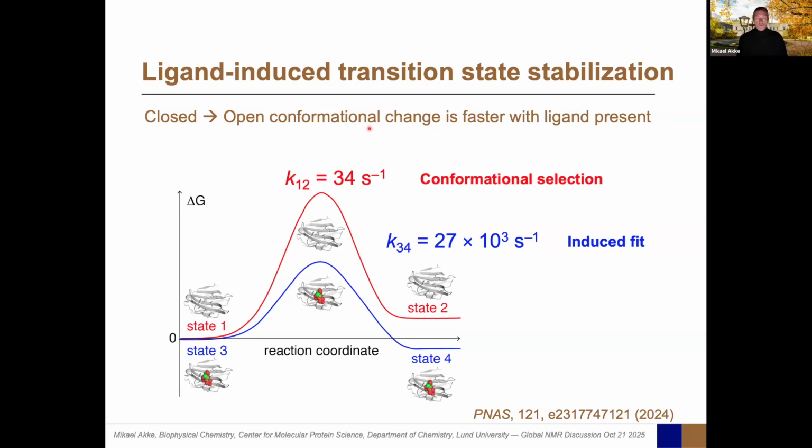We tried to use order parameters as a proxy for looking at conformational entropy. And once we know the entropy, we can then start dissecting total entropy into conformational entropy and solvation entropy. So we published a number of papers on studies like that for both lactose, but also drug lead compounds and fragments and so on.